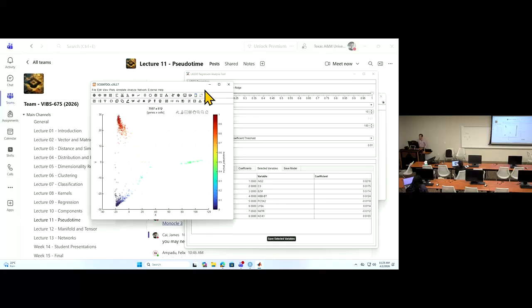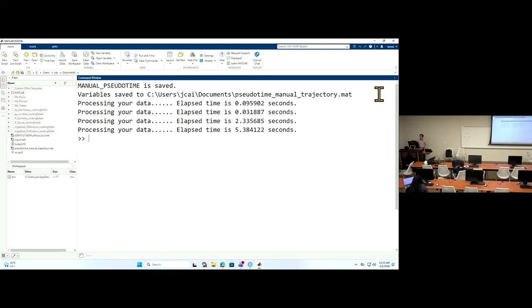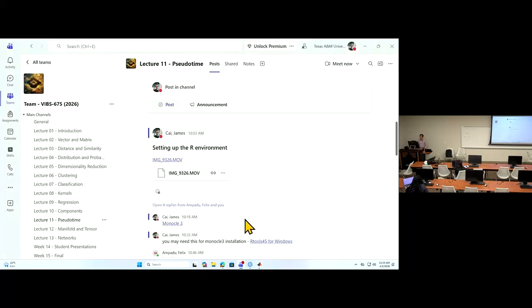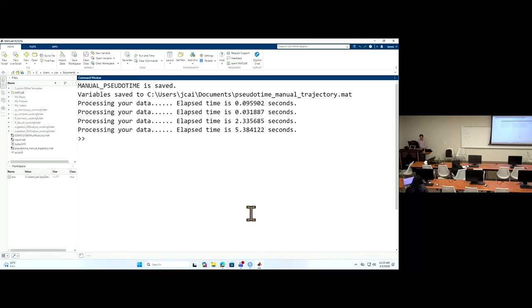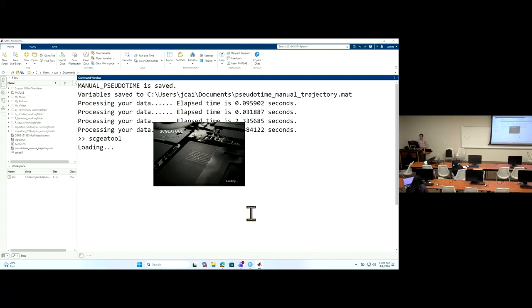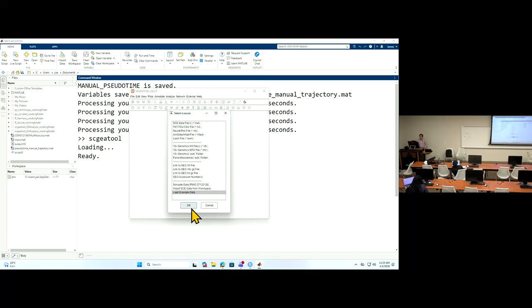Okay, so for the remaining couple of minutes, let me review what's on our agenda. So we did this. I think I can quickly show you how to do this, okay? So let's copy this key. You need to copy this, and come back to this. You see, you can load example data here.